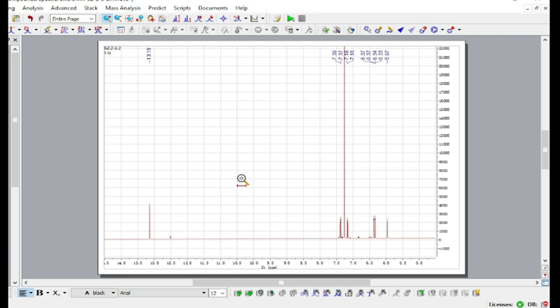So it doesn't mean that the molecular mass or the molecular formula that you have obtained from HREIMS is wrong. Your molecule definitely has 20 hydrogens, but the integrals that you have selected show half of the protons. So what you do is that you double the integrals.